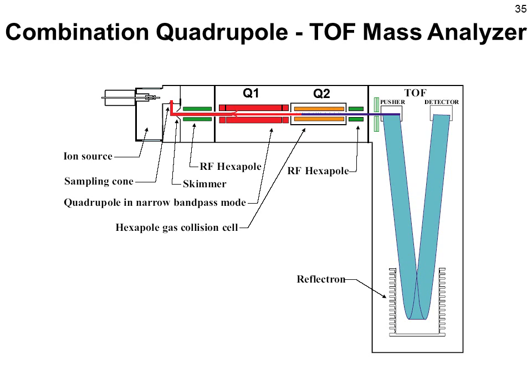Ions are collected for a certain time and then are pushed by a very strong and fast nanosecond electric pulse into the time of flight analyzer. In this way, a continuous beam of ions can be cut up into ion packages. The time of flight of each of these ion packages is measured, and as you can see, the instrument, as most instruments to date, contains a Reflectron, and then the ions reach the detector.